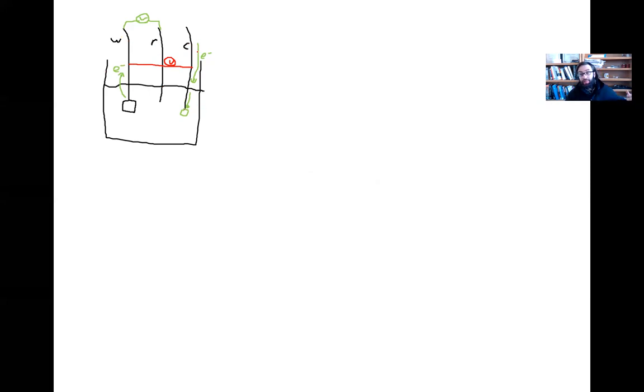So depending upon the size and the geometry of the counter and working electrodes, this will not be the same voltage, just in the opposite direction. It could be something different. Okay, but that's sort of the fundamentals of how a potentiostat works, what it's doing, and how a 3-electrode setup works.